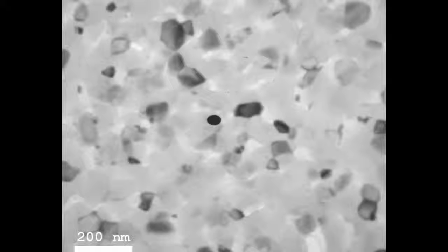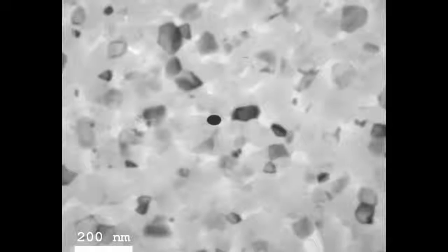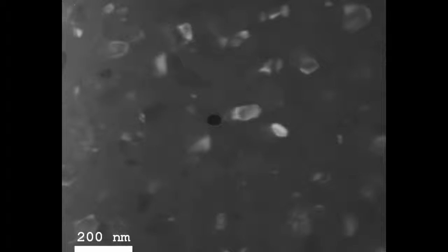We can instead choose to view a part of these deflected electrons and cancel out the central beam instead, the bright field image. So if we cancel that one out and watch the deflected part instead, we will get the dark field imaging view instead. This is sort of comparable to the light microscope, you know. So here you see the dark field imaging view. Now everything is reversed. We pick up some of the deflected electrons due to this Bragg criteria. And that makes them become white.